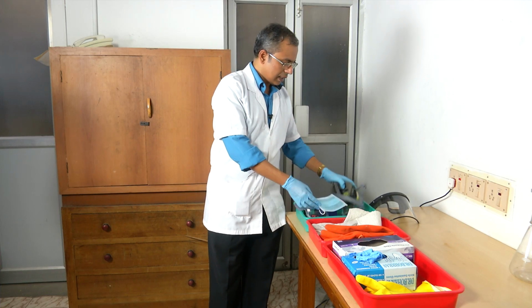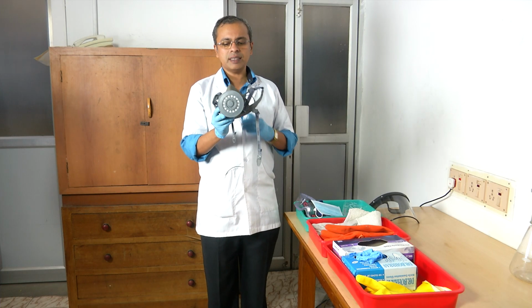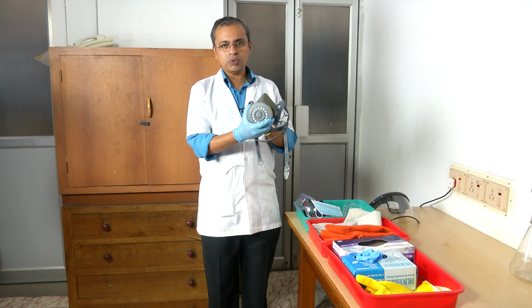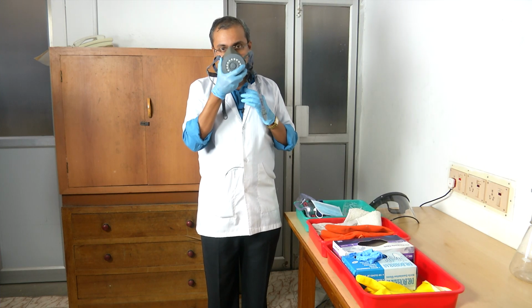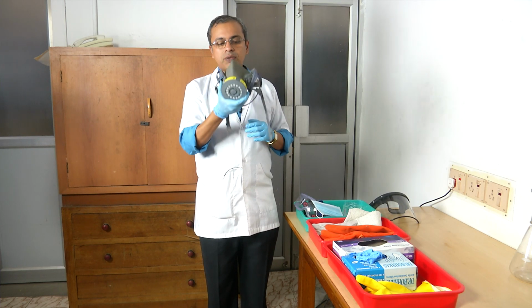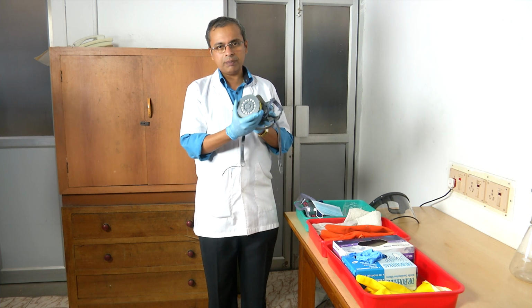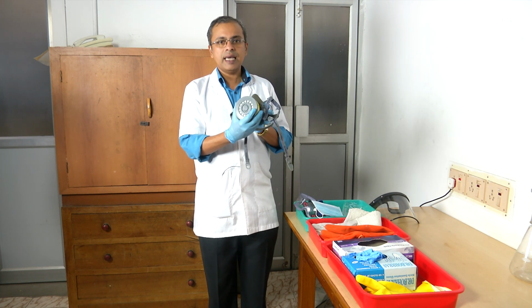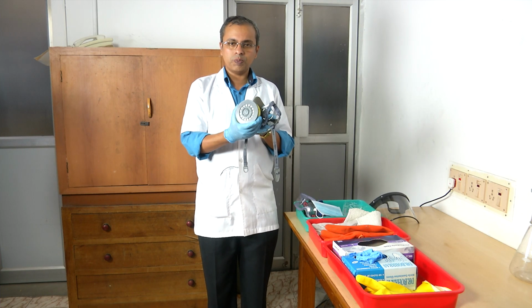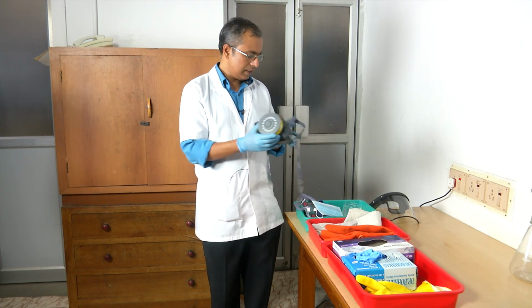You need to find out whether it is adequate, but if it is adequate you should be in a position to use it. What I am now showing you is a much more elaborate mask which deals with dust. Here there are some filters in the front which you can select, choosing what kind of filter you want to use. It would completely cover your nose, and whatever you breathe would then be filtered through this device. And so, it is a much more elaborate and designed device to protect you from dust or any particular chemical that may be present as part of your experiment.